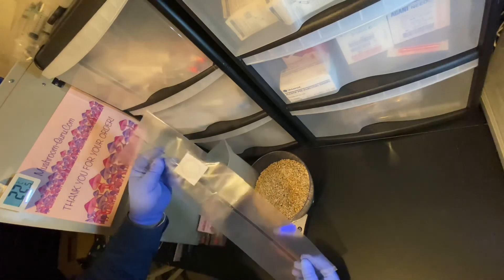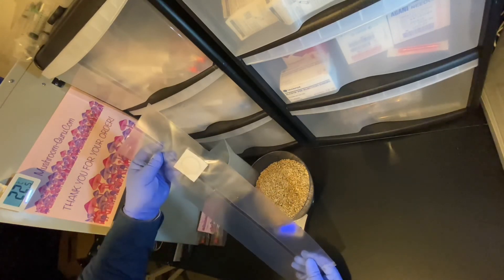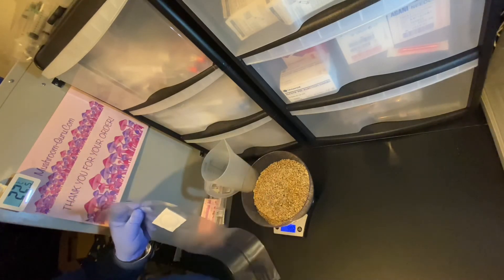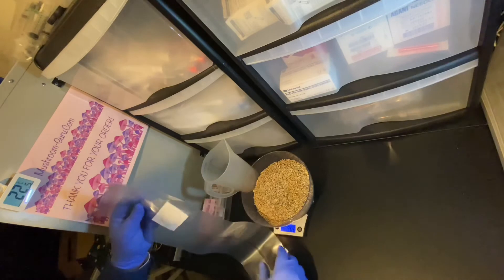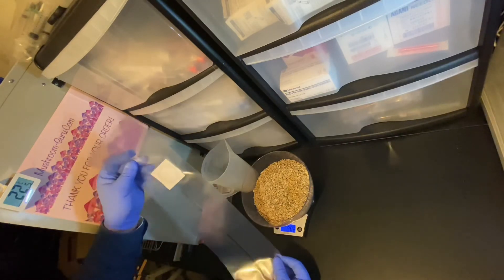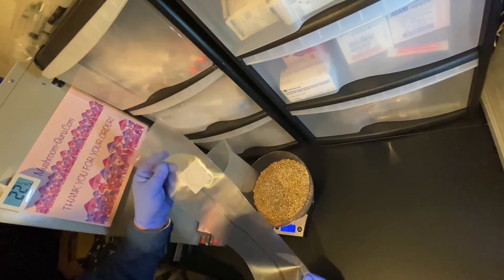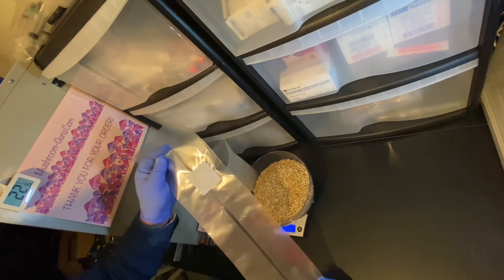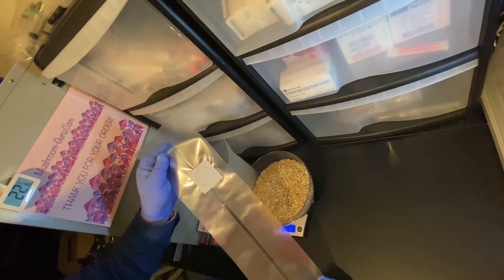What we do now is add the grain to the bag, then add 600 milliliters of water into the bag. That's basically all that we do — and you're ready to put it in the pressure cooker.